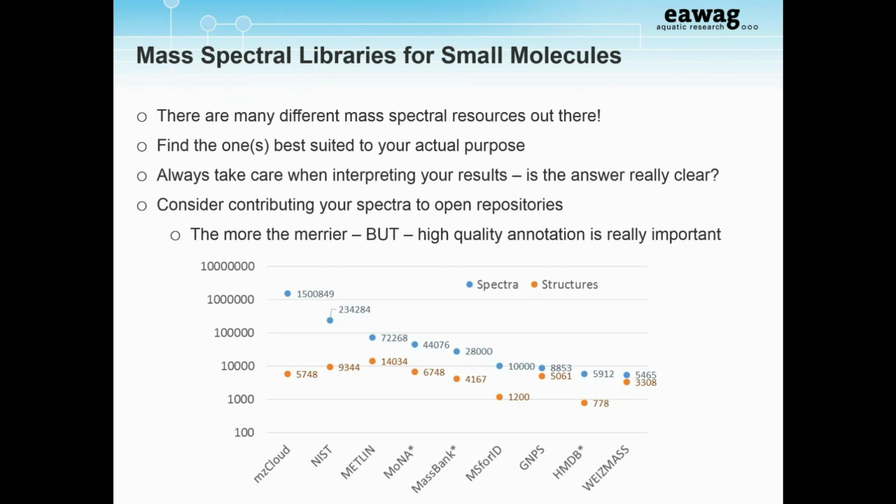Yep. So what we've actually tried to do within MetFrag is connect up the MONA database with MetFrag. So what you can do now is do your retrieval with KEGG, PubChem, or ChemSpider, or some of the other repositories. And what MetFrag can now do is calculate, based on the InChIKeys, the individual compound match to the spectrum if it happens to be in MONA.